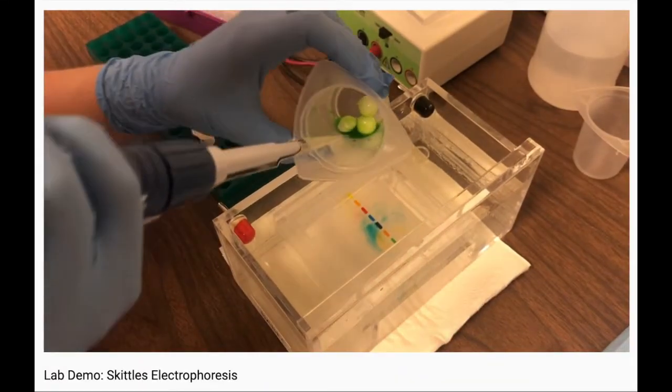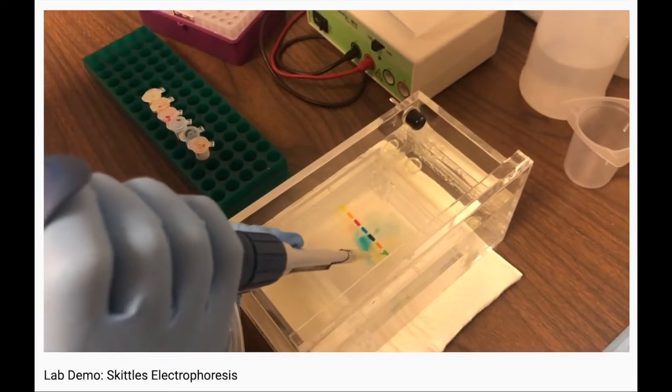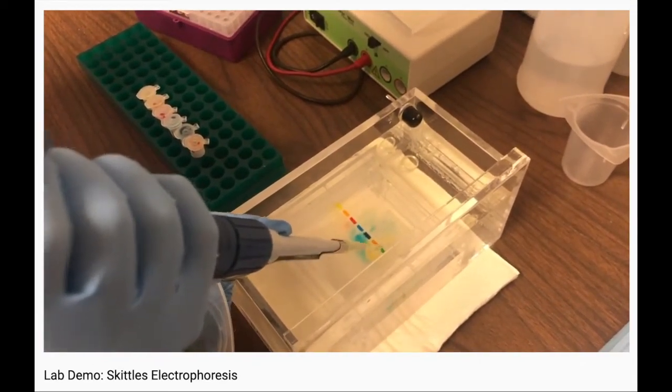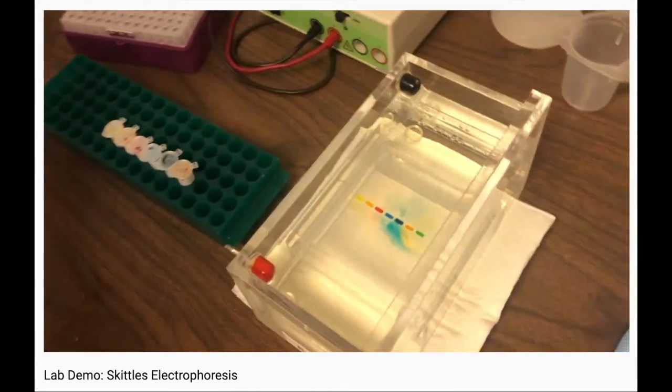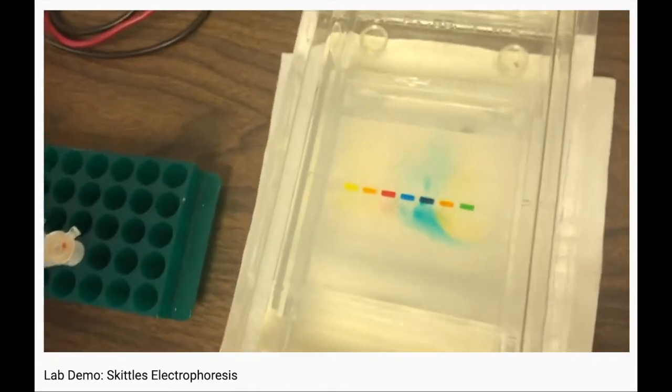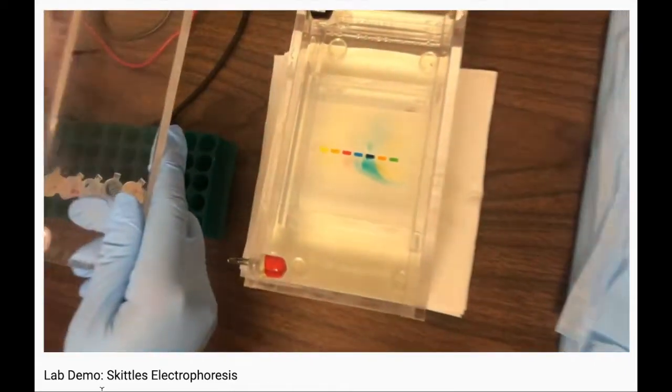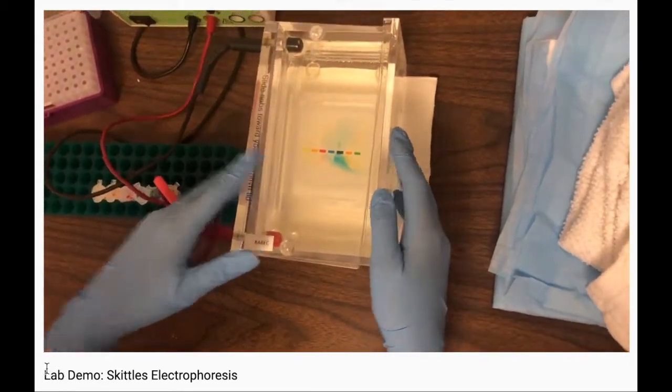So we're skipping ahead, we're adding the liquid from the outside of the green Skittle into lane 7, and as you can see, we have now loaded all 7 of our samples, and we're putting our lid on top of the electrophoresis box.